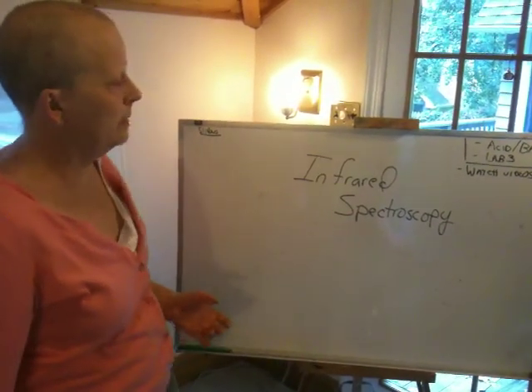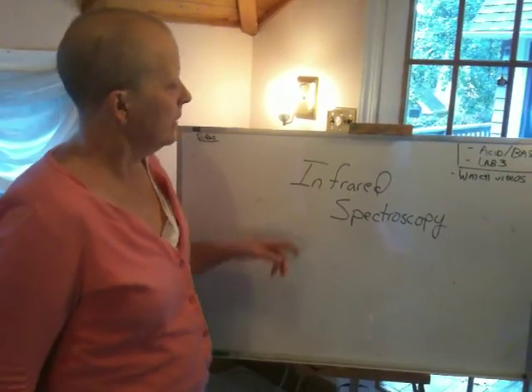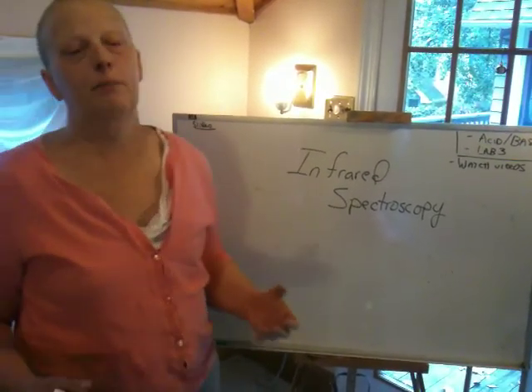Now, as I stated, because the lab itself is going to be more exploratory about acids and bases, I'm going to actually talk about infrared spectroscopy during this hour. Okay? Now, what is spectroscopy in general?